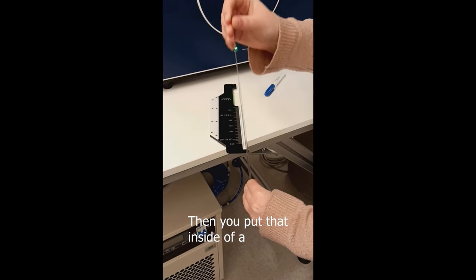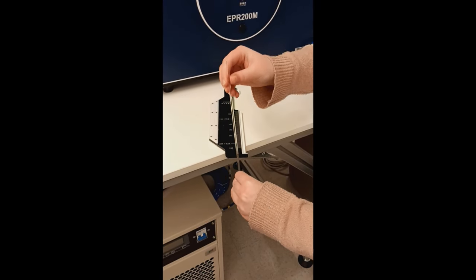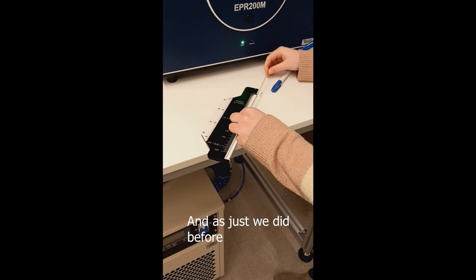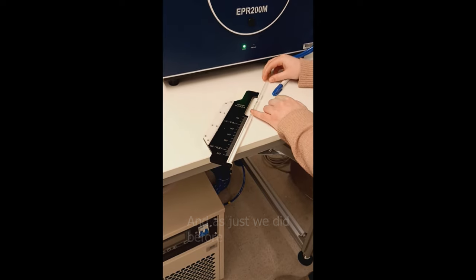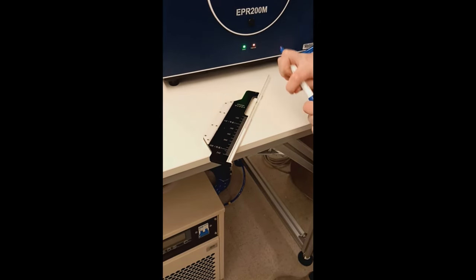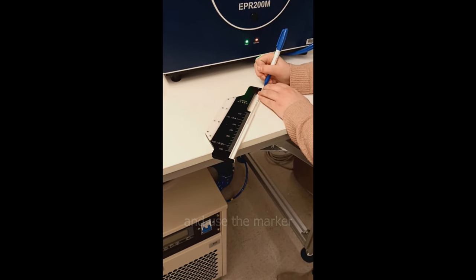Then you put the capillary inside of a larger ESR tube, and then just as we did before, we line it up and use a marker to mark the top of the tube.